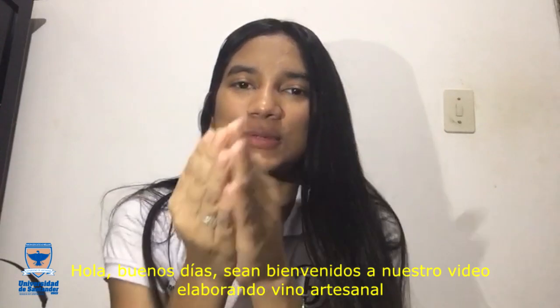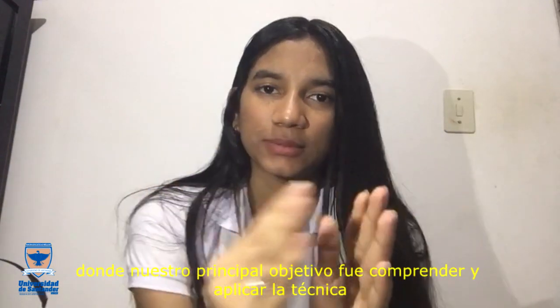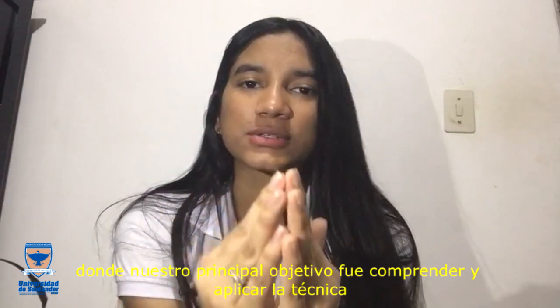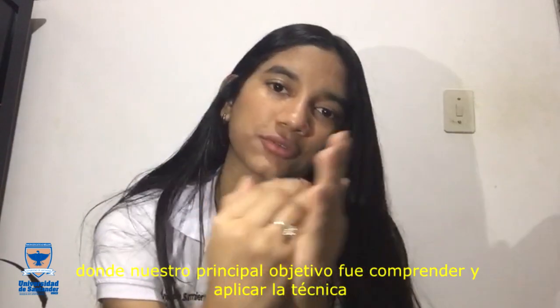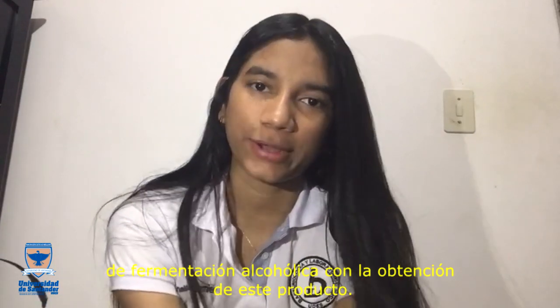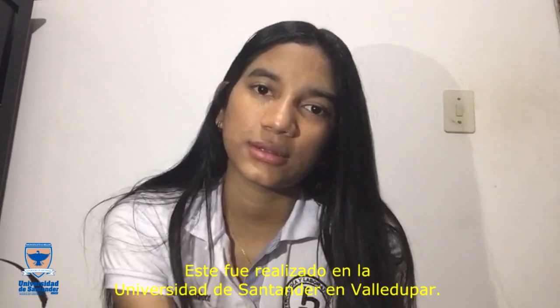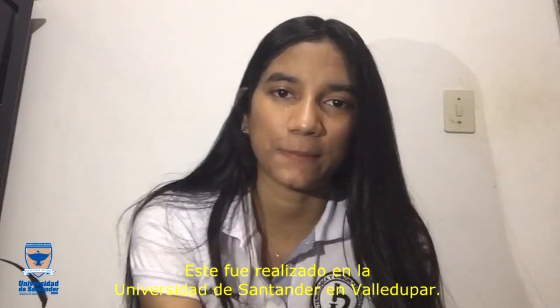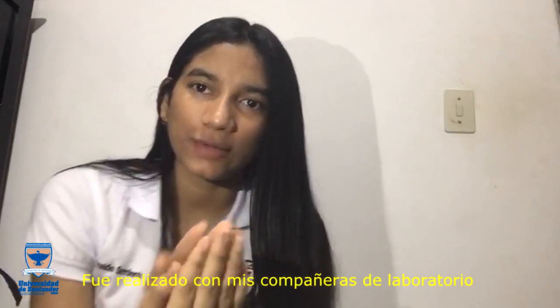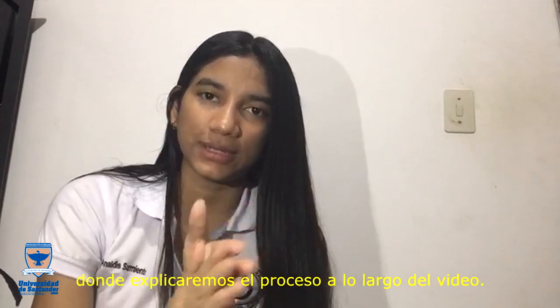Good morning. Welcome to our video elaborating artisan wine, where our main objective was to apply and understand the technique of alcoholic fermentation with the obtaining of this product, in this case the wine. The project was realized at the University of Santander in Valledupar. It was made with laboratory partners, where we'll explain the process all throughout the video.